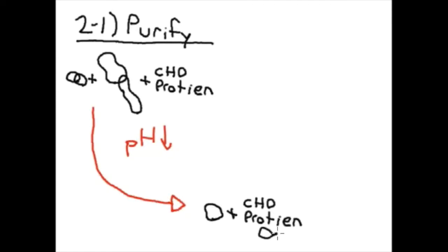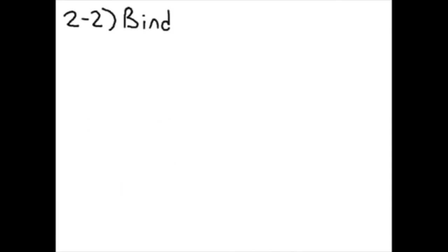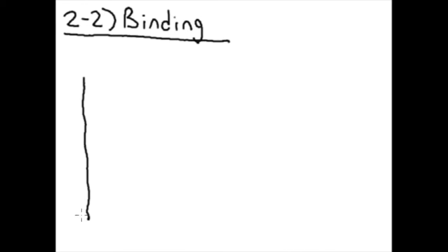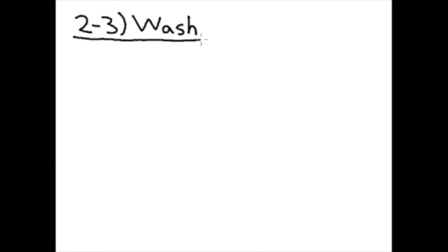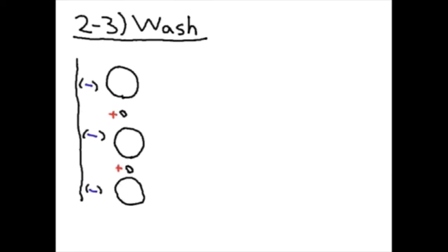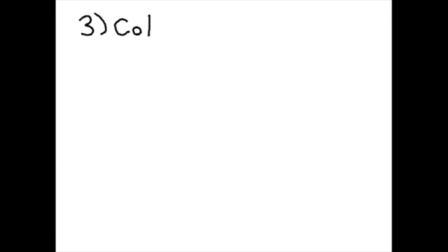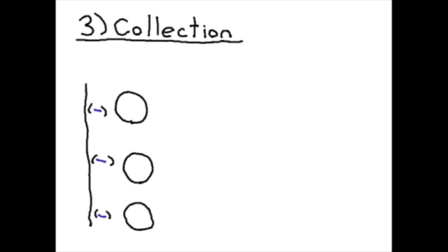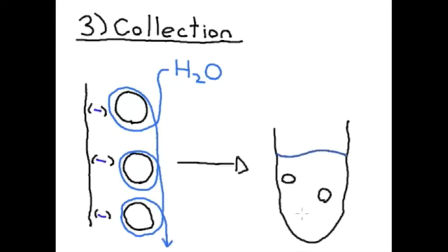Following centrifugation, the supernatant is added to specifically designated silica-coated columns, which function to retain the plasmid DNA through undescribed interactions. The silica column with bound plasmid DNA is washed with 70% ethanol, which removes other small charged contaminants which are bound to the silica membrane. Due to DNA having lesser solubility than these contaminants, the plasmid DNA is not removed from the membrane during this wash step, while other, more soluble contaminants are. Pure water is used to solubilize plasmid and thus remove it from the silica column.